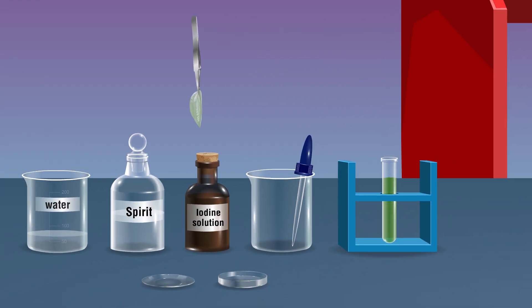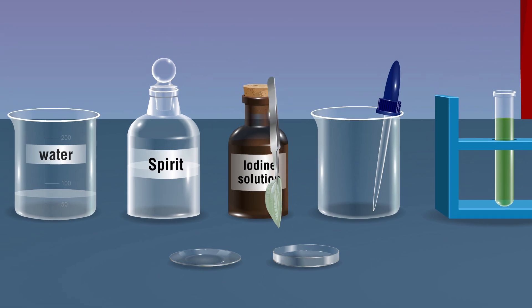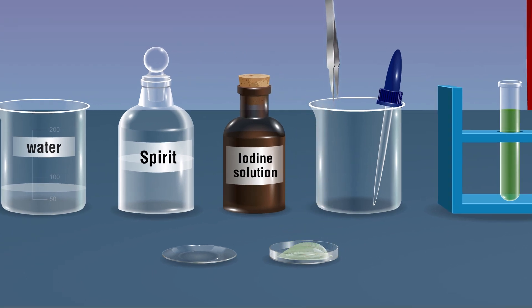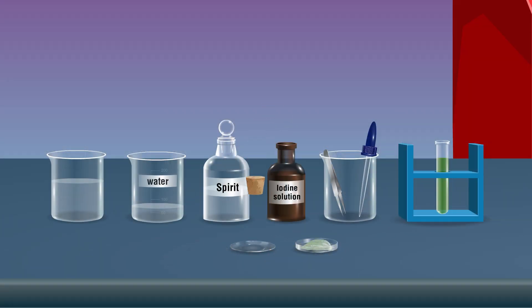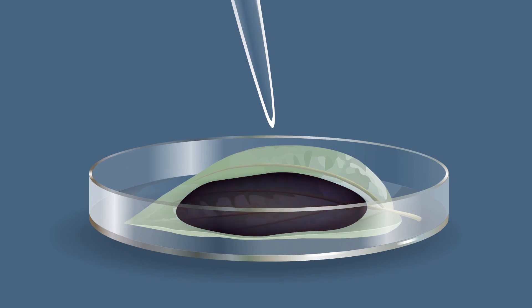Take the leaf from the test tube carefully and wash it with water. Add a few drops of iodine solution.